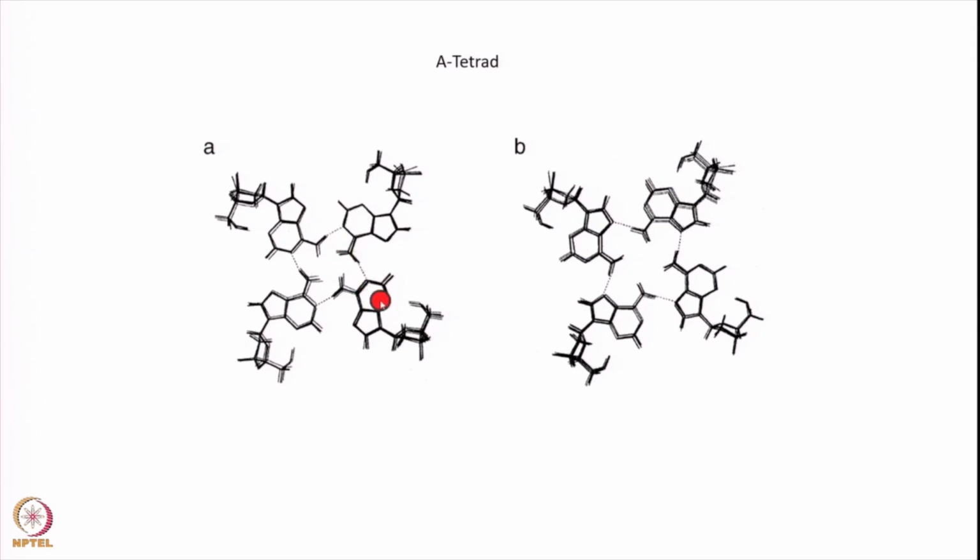So this is the hydrogen bond. Now what happens is this amino group is close to this proton here, and this is the H8 proton. That was the peak which you were seeing, the H8 proton, and this amino is also close to this proton. This proton is the H2 proton, and we were seeing this amino to the H8, amino to the H2.